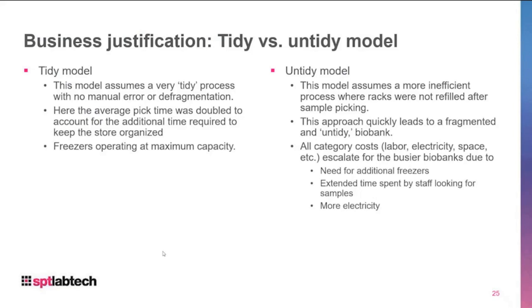So just to set this up a little bit before jumping in, the study was done with Arctic and -80 storage at a biobanking facility in the UK. The idea was to compare the difference between manual storage operations, the hands-on model, and automated retrieval processes, so real like-for-like comparisons where possible.